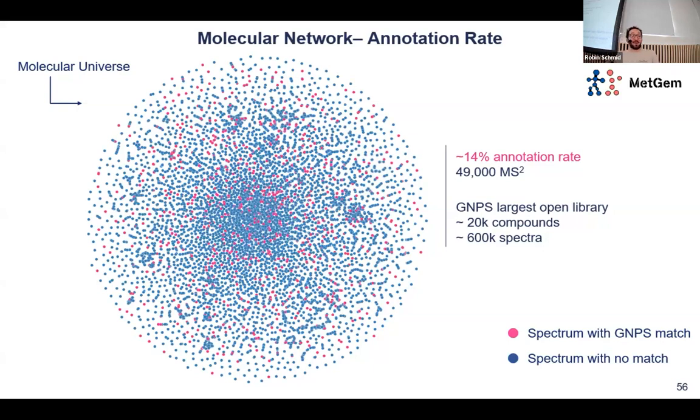Yeah. Because to me, at least, those 2D representations of a very, very high dimensional space are very hard to do, right? There's spectral similarity. We saw that for those polyphenolic glycosides, right? There is some similarity of the glucosides to polyphenols and so on, but then in the end, there's also similarity to so many other compound classes.